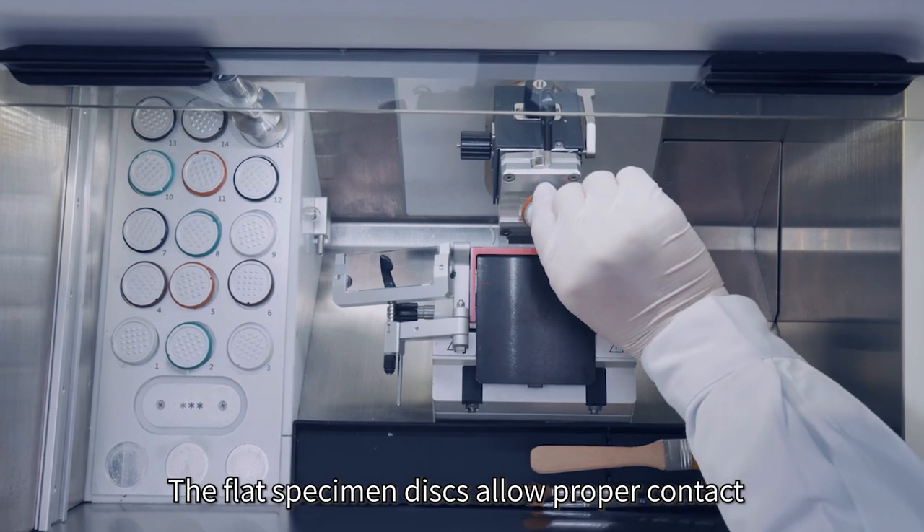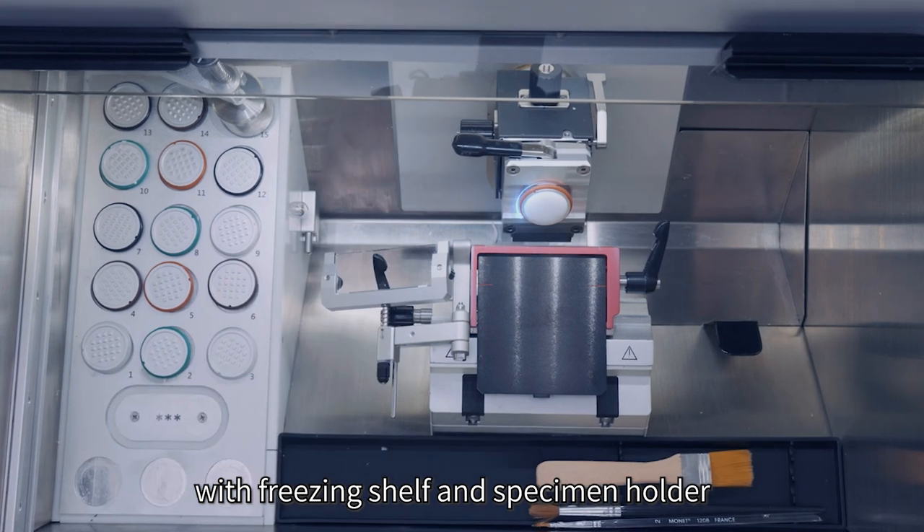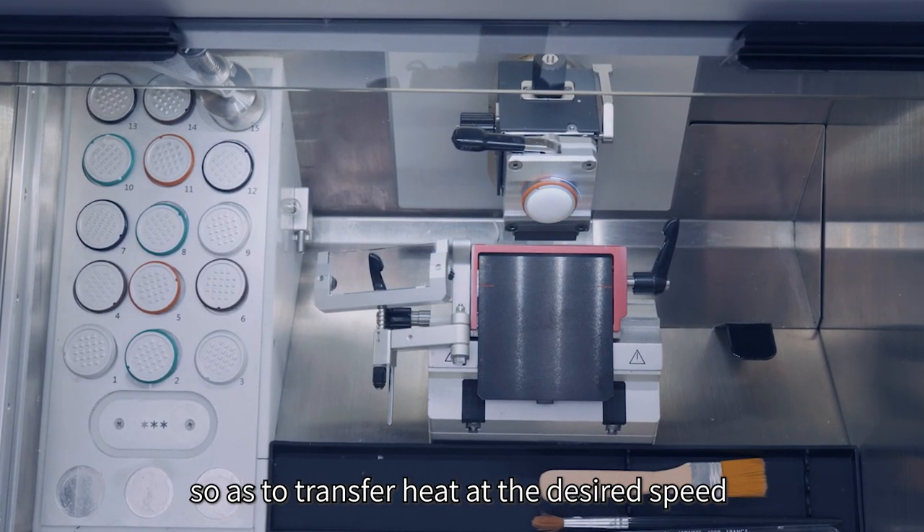The flat specimen discs allow proper contact with the freezing shelf and specimen holder so as to transfer heat at the desired speed.